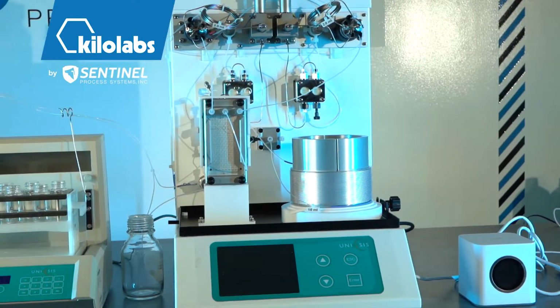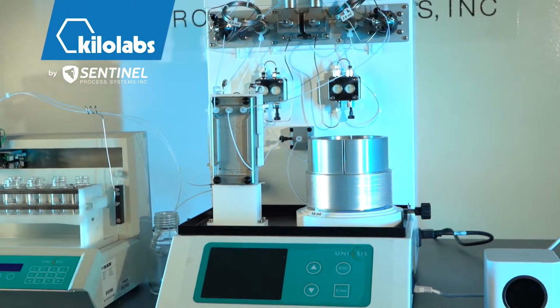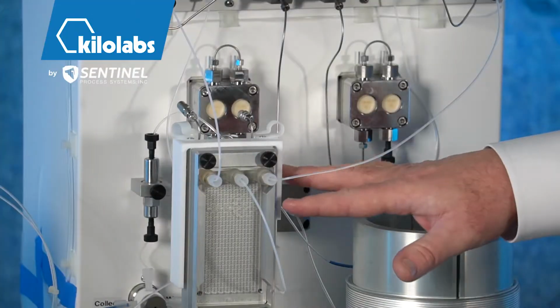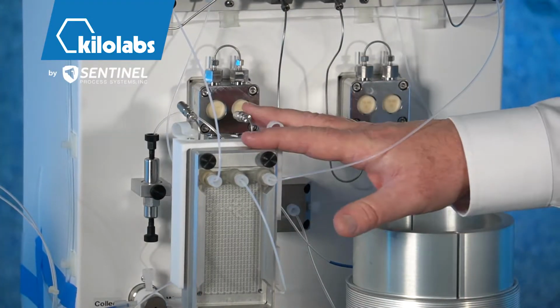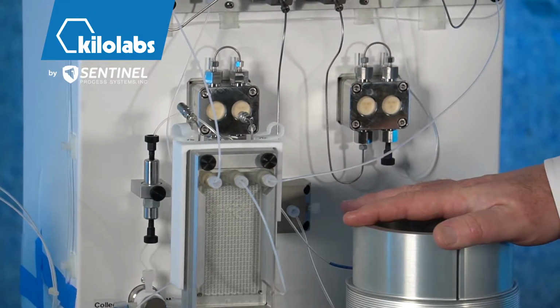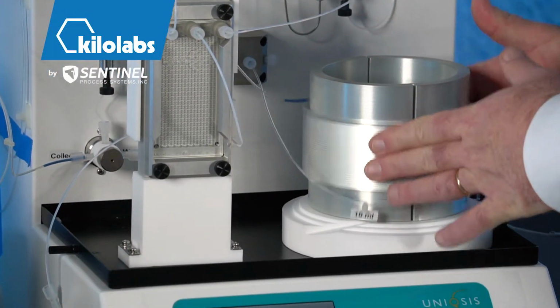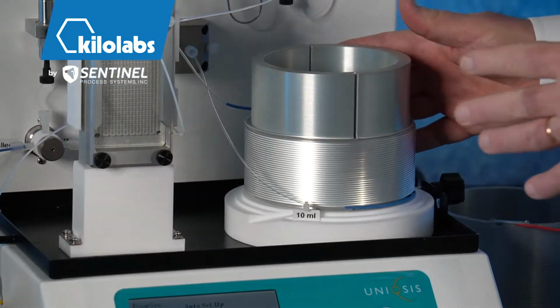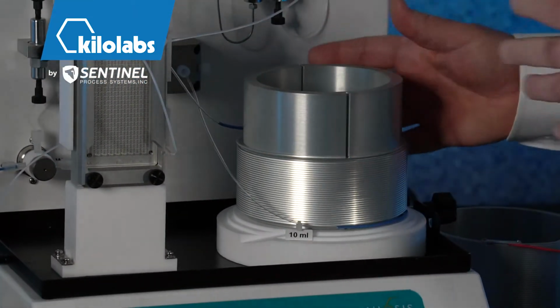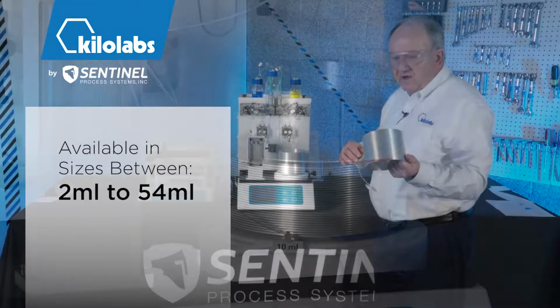We then go from the high pressure pumps to, this is a standard setup, a mixing chip, 1.6 ml with high static mixers in it. And from the static mixers, the fluid flows into a flow coil. The flow coil here is 10 ml PFA, and it sits over this mandrel. And the mandrel, in essence, provides for high heat transfer. You can also get other coils of different volumes and sizes.